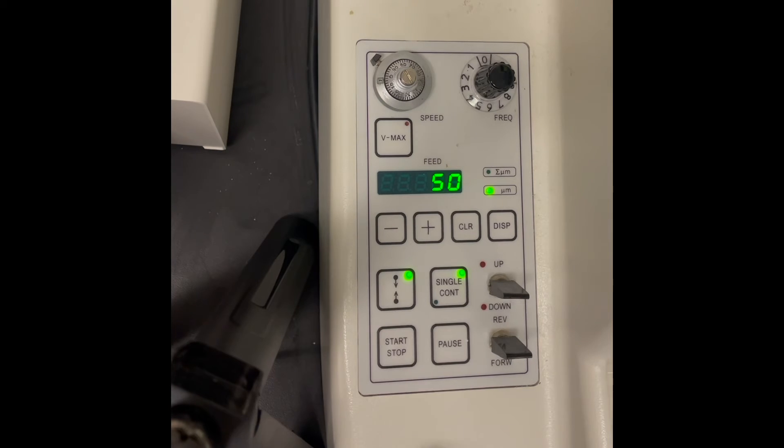Once the cut window is set, we have two options for our sectioning. The first is to use the single cut setting by pressing that button followed by the start button, or we can also use a continuous cut setting, which is shown by pressing that same button again and then the start button.